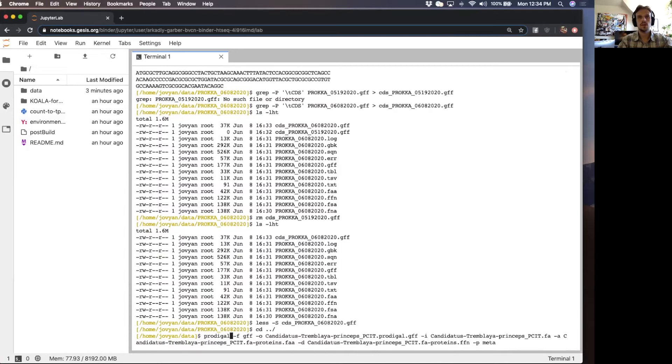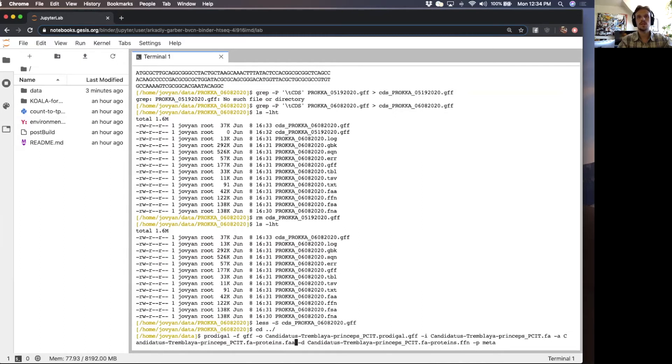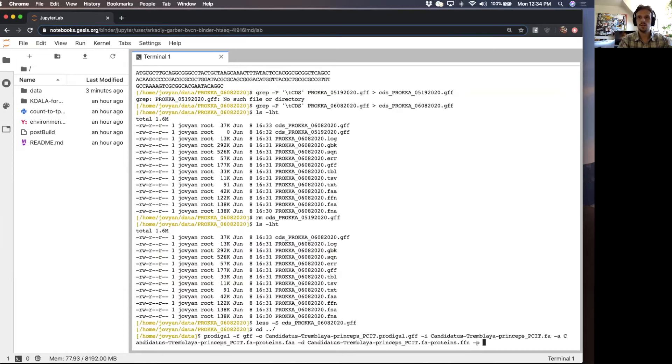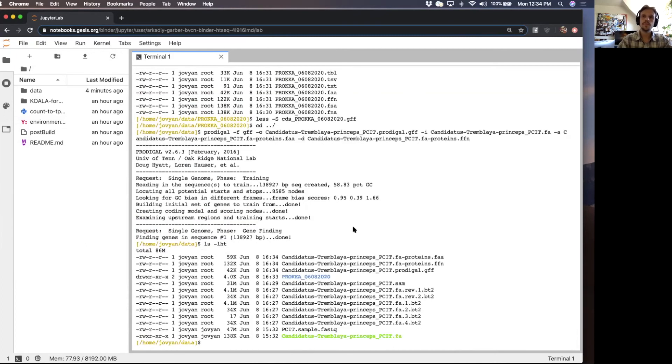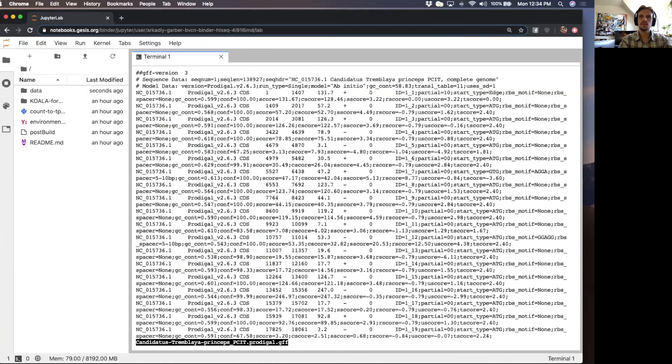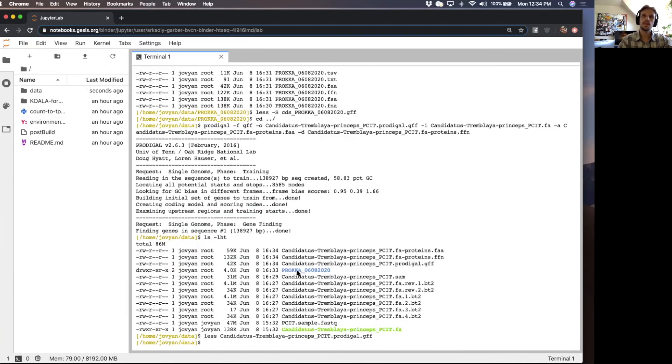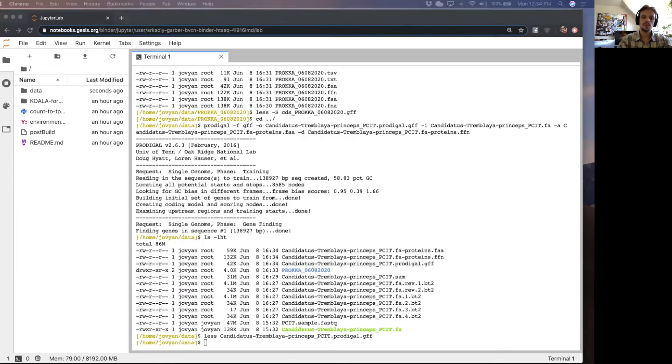I'm also going to run a quick Prodigal script to show that we can also generate a GFF file using Prodigal with the dash F GFF flag output. This is our input. And we're going to also just for fun output the gene sequences in FASTA amino acid format and FASTA nucleotide format. All done. We basically now have two GFF files that we can use for HTCount, but I'm going to go ahead and use the one from Proca.